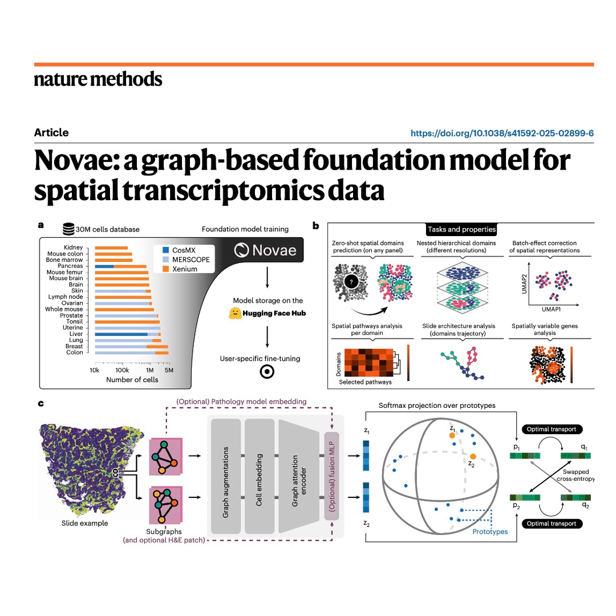Exactly. You're analyzing expression at the spot level. Then you have the second category, the high-resolution, imaging-based techniques, Xenium, Merscope, all the big names. And these give you that incredible subcellular detail. You can see exactly where molecules are, but the trade-off is they're limited to pre-selected gene panels. You might measure 500 genes instead of, say, 20,000.